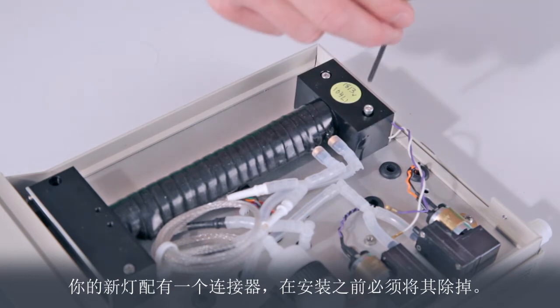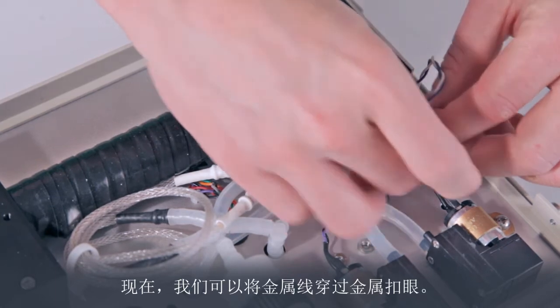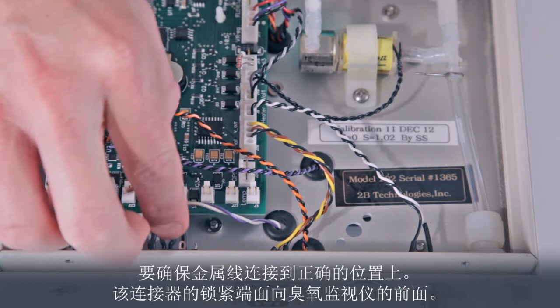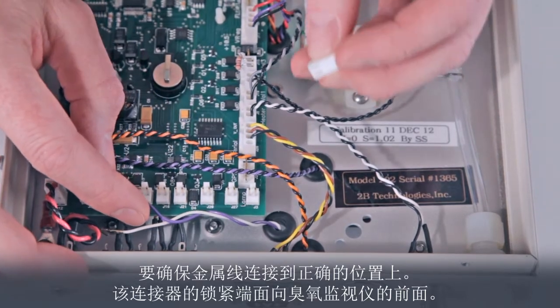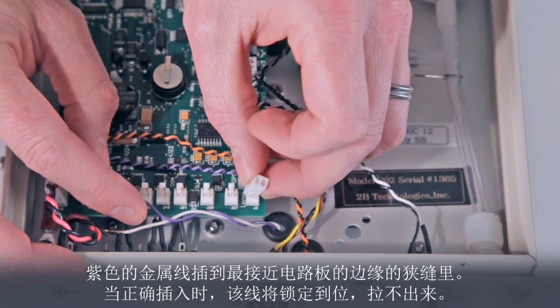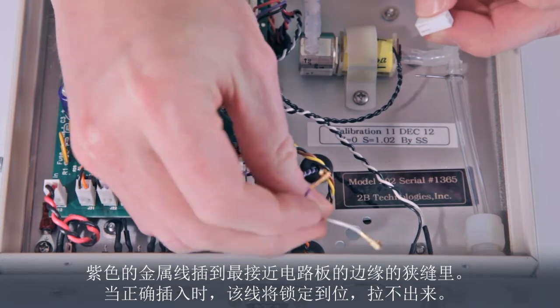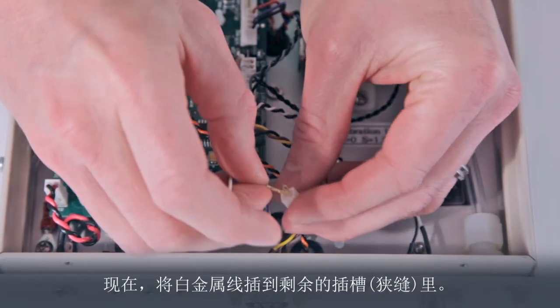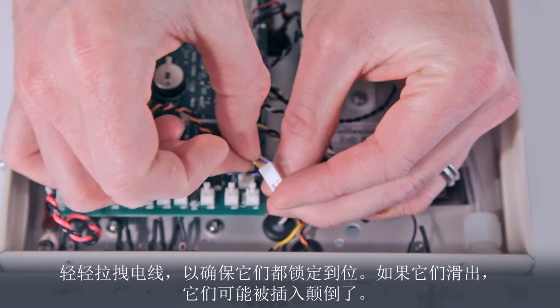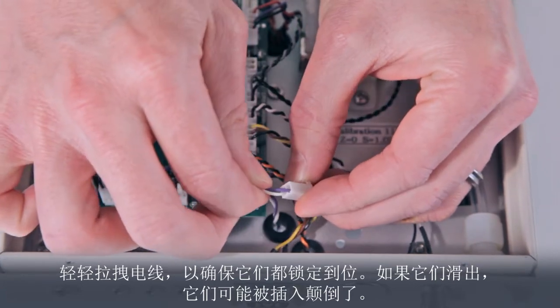Your new lamp will come with a connector which must be removed. Now we can pass the wires through the grommet. Be sure to connect the wires into the correct positions of the connector. The locking end of the connector faces the front of the ozone monitor. The purple wire inserts into the slot nearest the edge of the circuit board. When inserted correctly, the wire will lock into place and will not pull out. Now insert the white wire into the remaining slot. Gently tug on the wires to make sure they are both locked in place. If they slide out, they probably were inserted upside down.